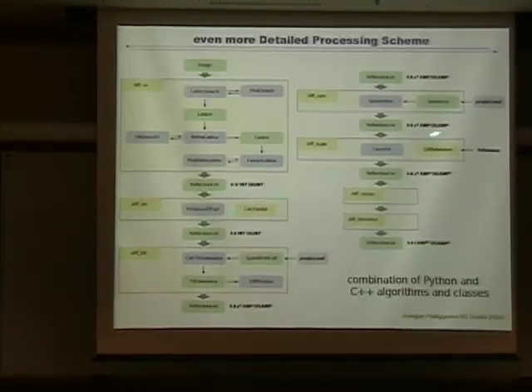Because the scaling step here does not require a lattice line. Yeah, but in the end you have to create the lattice line. Yes. And so the question is how you do that. Well, in the final merge, you will have the diffraction data from all images in one merge, and that's when you have to do the discretization. Prior to that, it is not necessary. So when you say the fit is reliable when you have that amount of data, then I think we will proceed to implement that immediately.